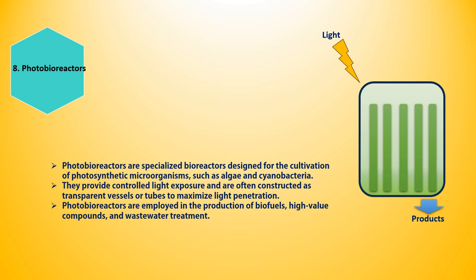And number 8 is photobioreactors. Photobioreactors are specialized bioreactors designed for the cultivation of photosynthetic microorganisms such as algae, cyanobacteria, etc. and they provide controlled light exposure and are often constructed as transparent vessels or tubes to maximize light penetration.